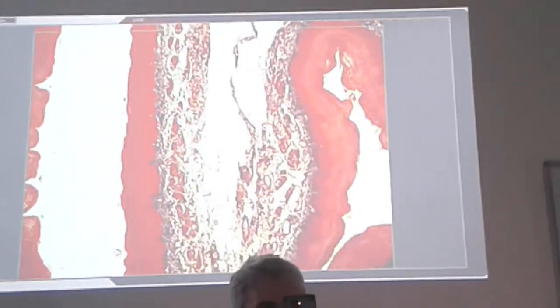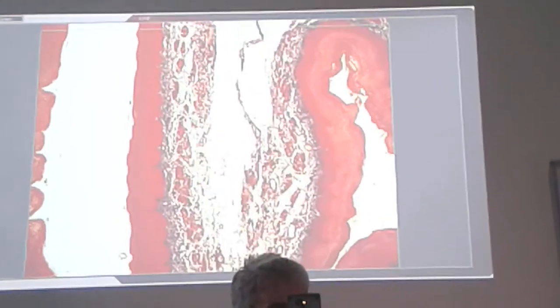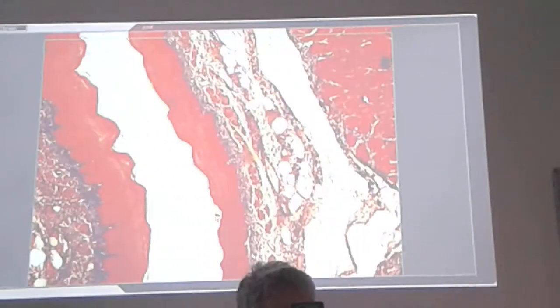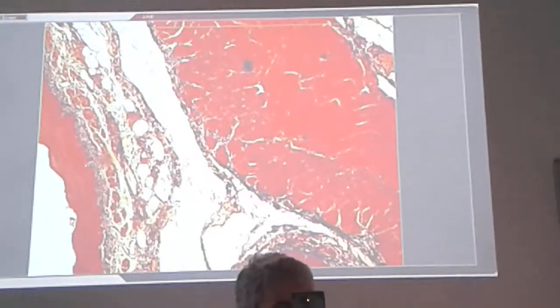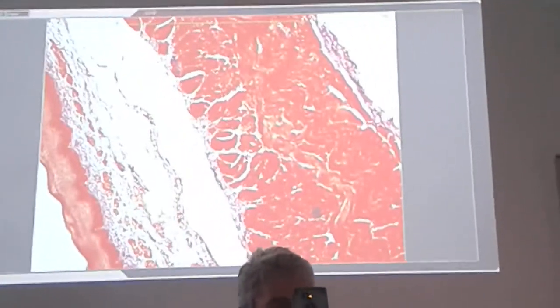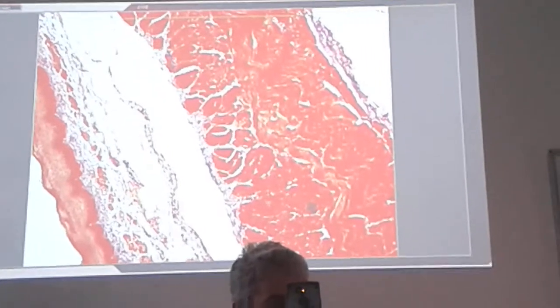As you remember, we can still observe the mucosa, surface, and then the next layer with the lamina propria and submucosa, and then the tunica muscularis, tunica externa, and then lastly the adventitia, or in some parts the serosa.